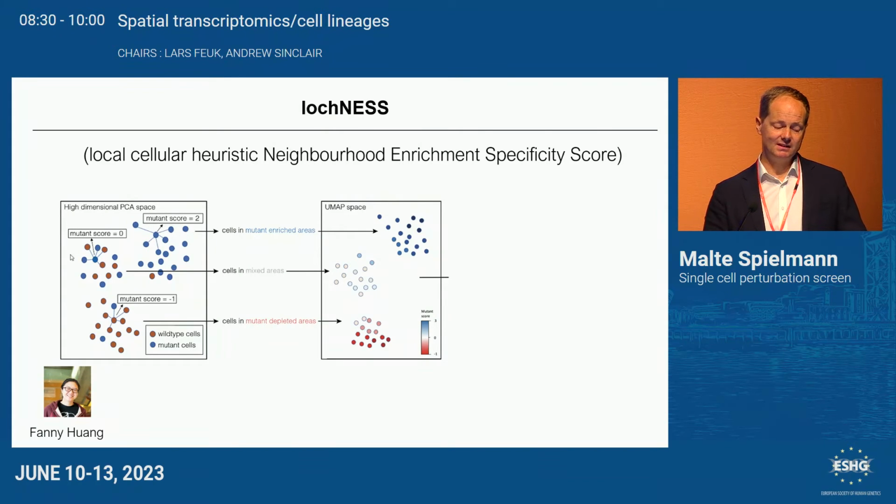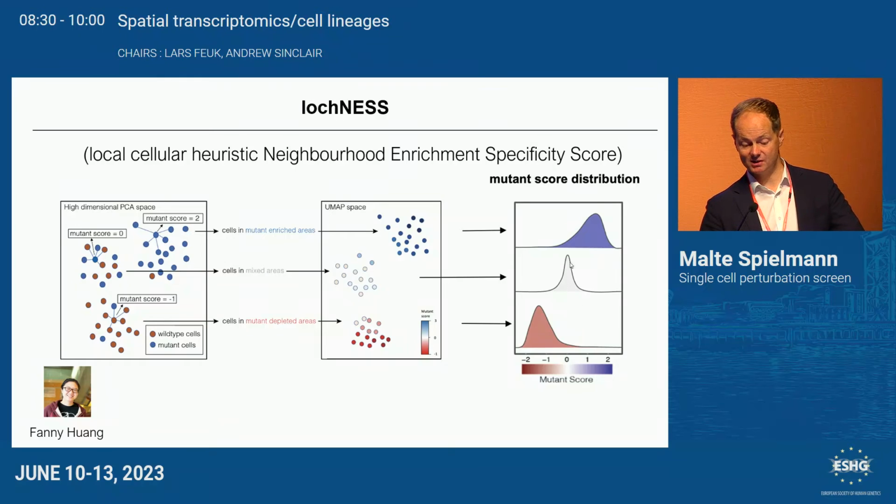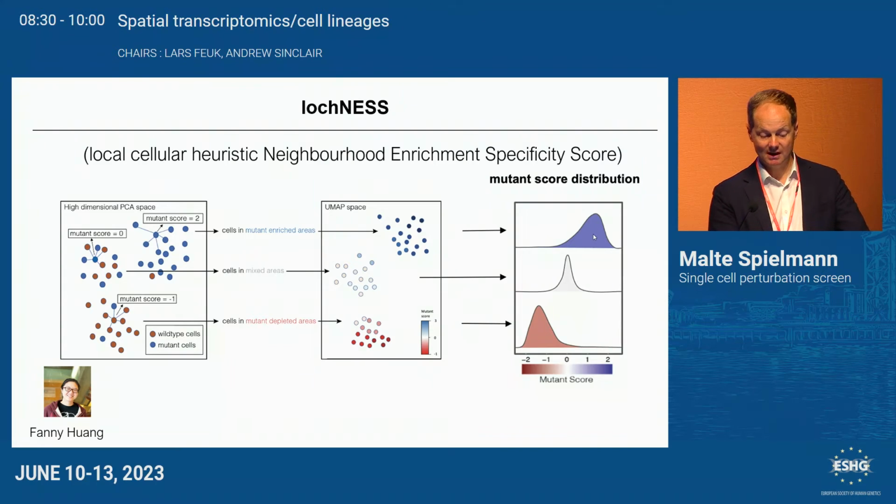So the idea is that we have the wild type and the mutant and we compare them. In a wild type situation, you would always have wild type cells surrounded by mutant cells coming from the mutant if there's no change. But then there are going to be specific regions where there are more wild type cells, that would mean there's a mutant loss, or regions with more mutant cells that we call mutant gain. And we wanted to visualize this. And this is exactly what the Loch Ness score does. So this would be the normal wild type, and here are discrete losses, and here are discrete gains. How does it work, or how could you use Loch Ness?